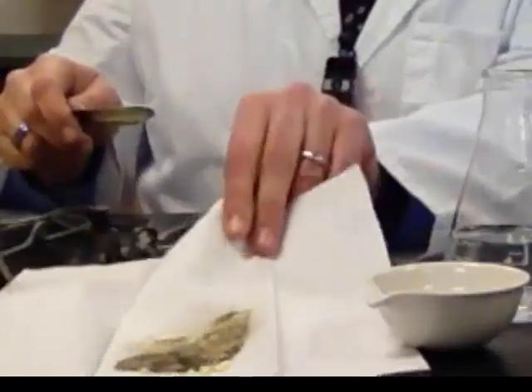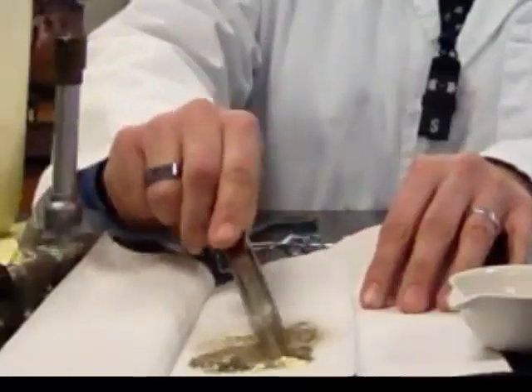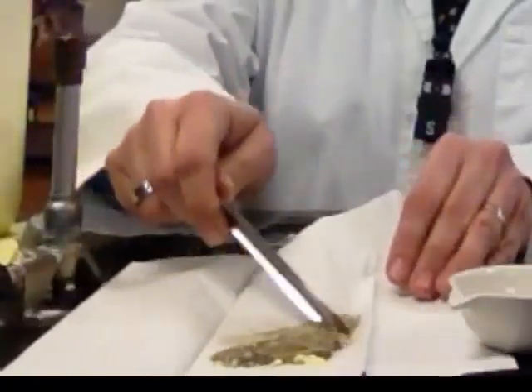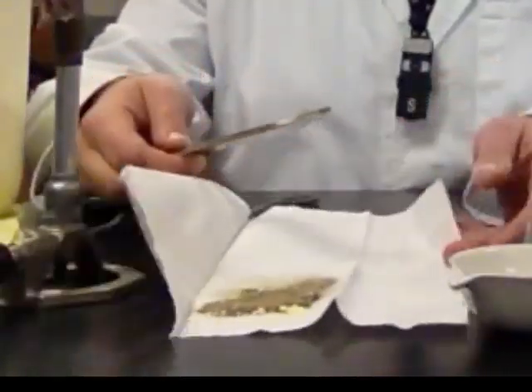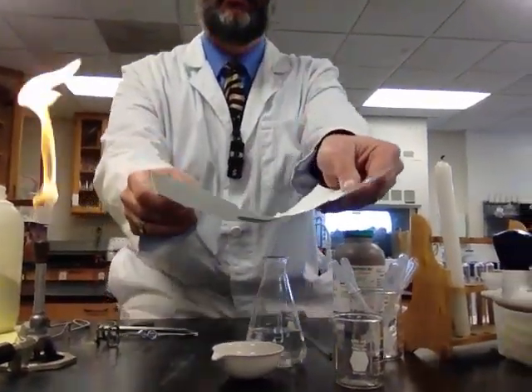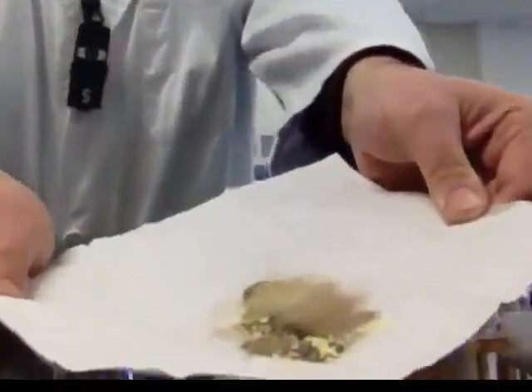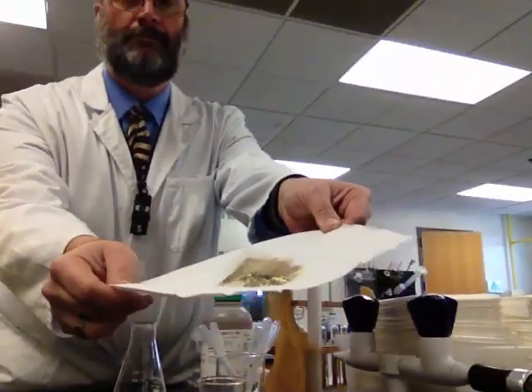Okay? So you saw what they started looking like. The sulfur is very yellow. The iron is black. Mix them together and this is what you get. Okay? So jot down some observations. Let me see if I can hold that a little closer for you. Okay?